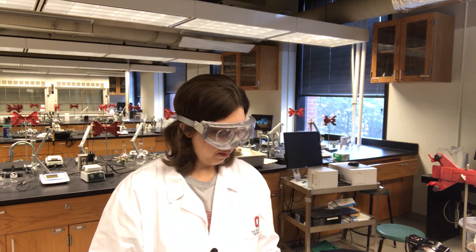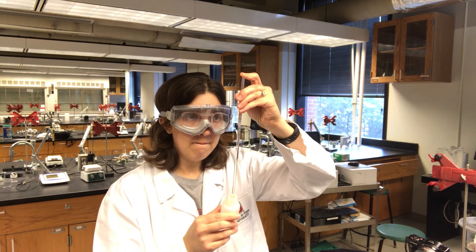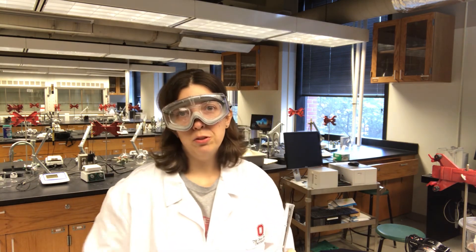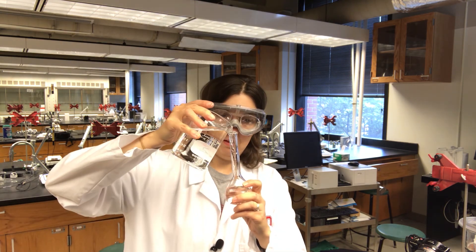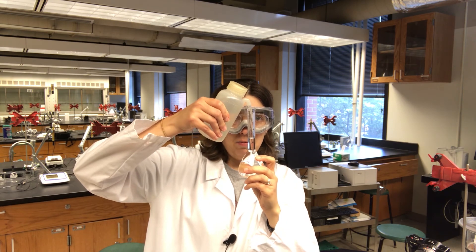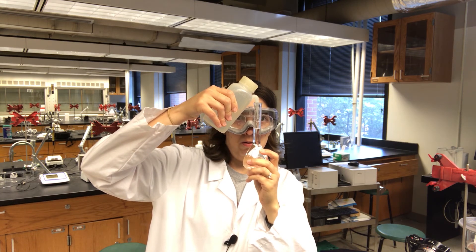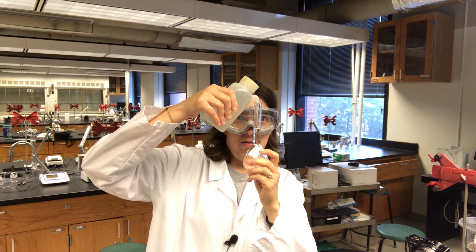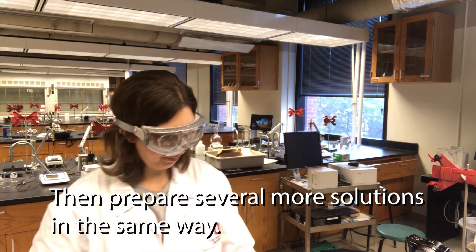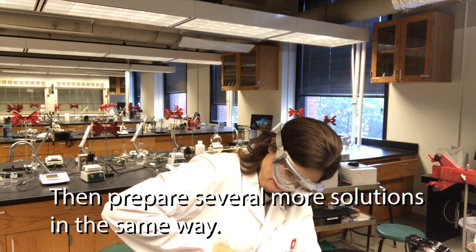I'm going to add 1 mil of my ISA. And now I'm going to dilute to the line with water and hopefully not overflow this time. Carefully filling to the line — there we go. Now I'm going to cap and invert.